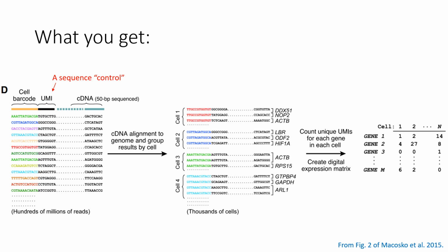After PCR, you will have multiple copies of that fragment, all with the same cell barcode and UMI. All of the sequencing reads from a single cell associated with a single UMI are pooled. This accounts for bias induced by exponential PCR amplification. Once reads are sorted, you can compare levels of gene expression across cells, like what you see in the table on the far right.